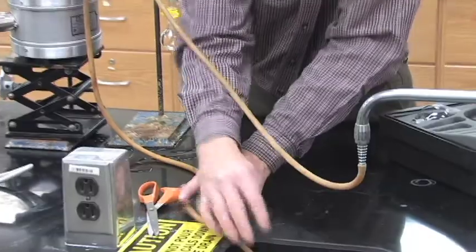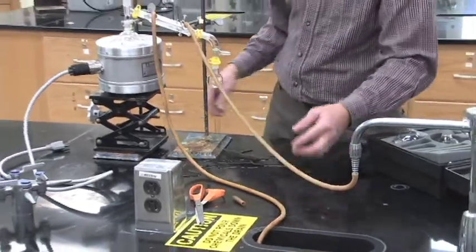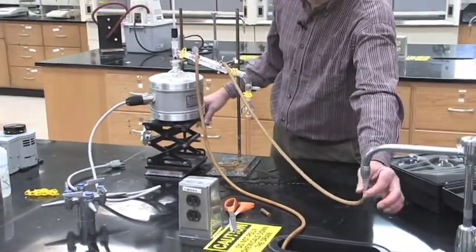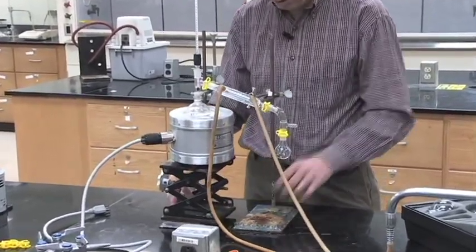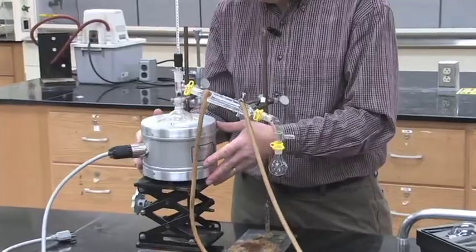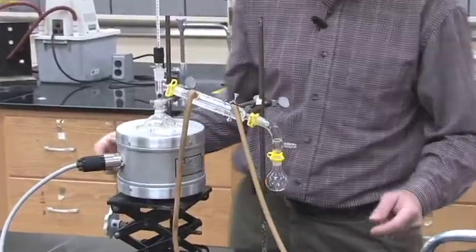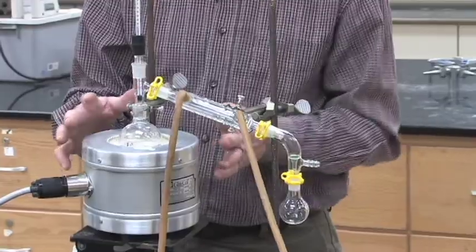And if you have the water on too high, what will happen is the hose will come off of either of the outlet on the sink, the faucet, or it'll come off of one of the outlets on your condenser. And it'll end up spraying across the lab and getting the person across from you wet. And they won't be very happy with that.